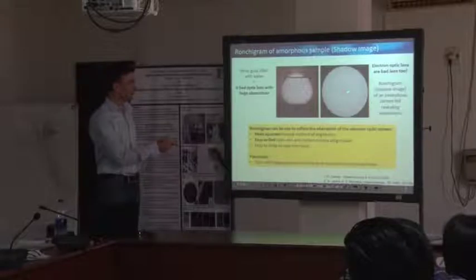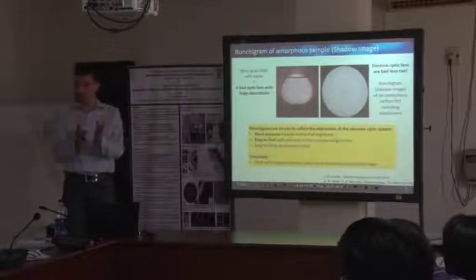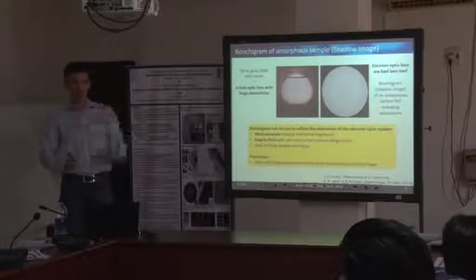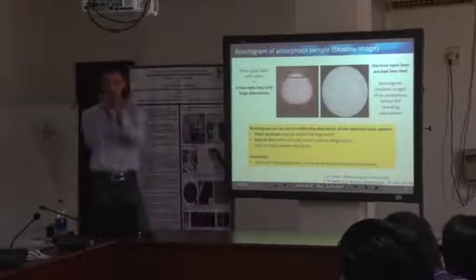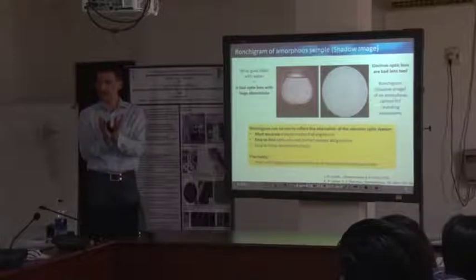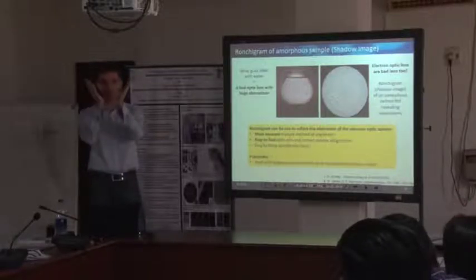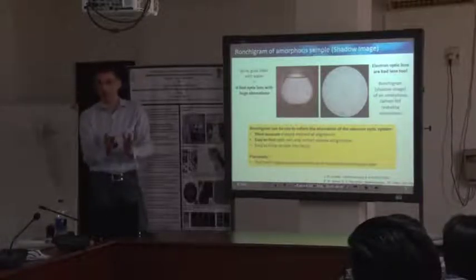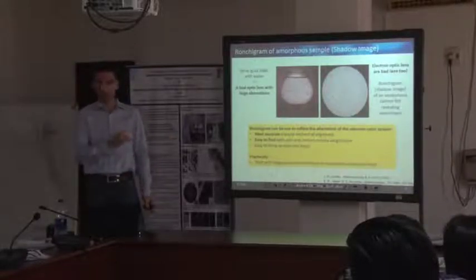It's easy to find the optical axis, because for aligning our electron beam parallel to the optical axis, you can just shift your probe up and down by changing the focus of our objective lens. By that you will see whether your sample moves or not. Because if your probe just moves up and down parallel to the optical axis, then your shadow image does not move, it just gets enlarged or demagnified. But if our electron probe is inclined to the optical axis, then it would move in a certain direction, meaning that your shadow image would move by just focusing and defocusing our sample.